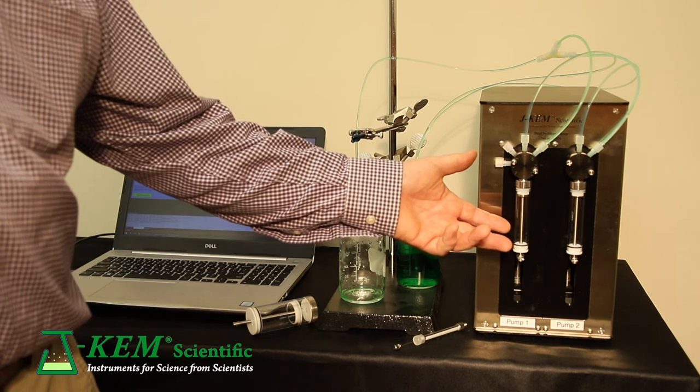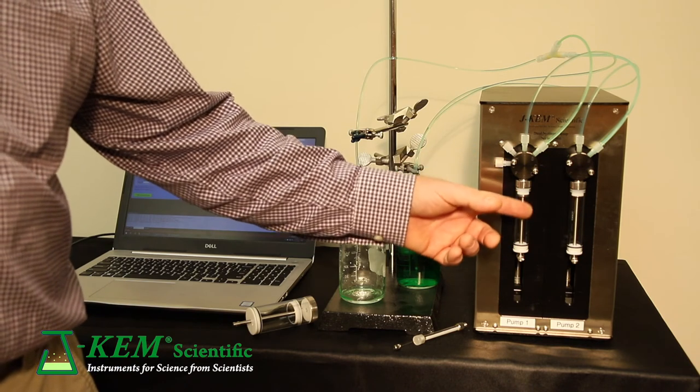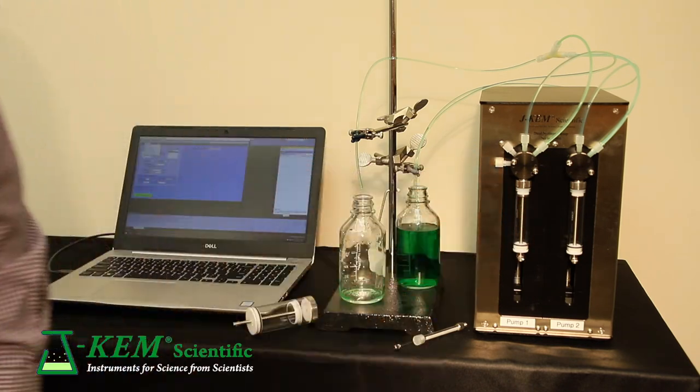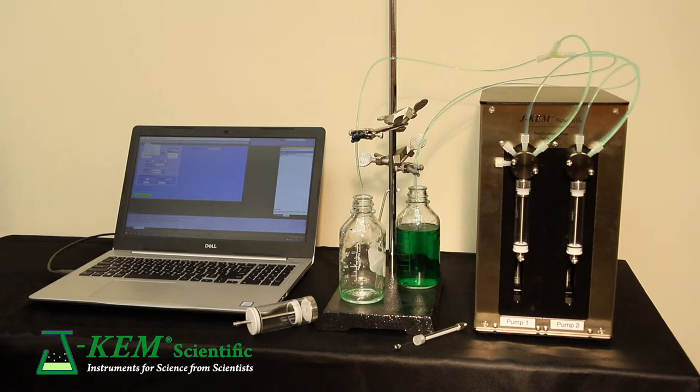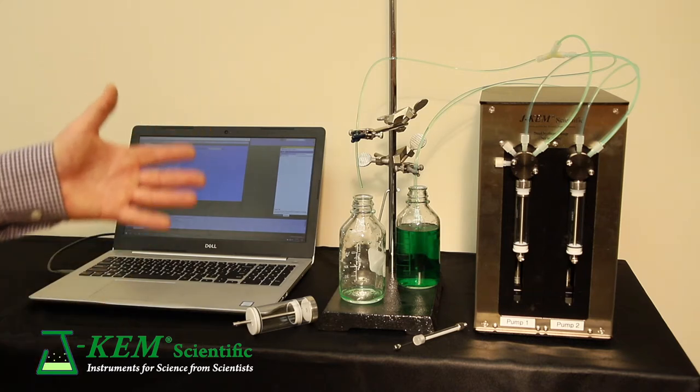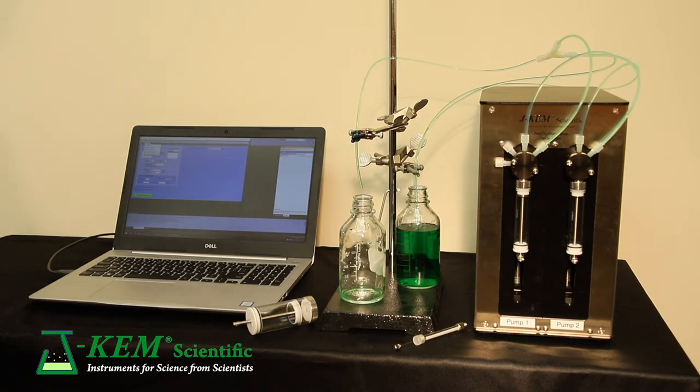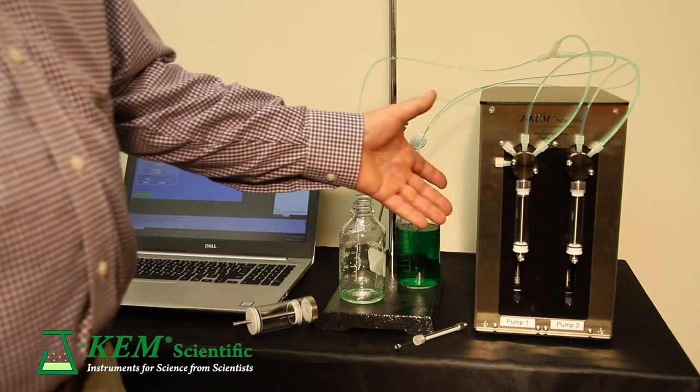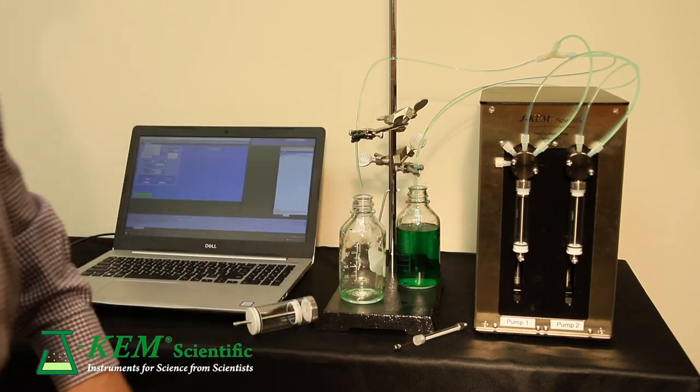Even with the 10 milliliter syringe that they have on here, the flow rate can range from 3 microliters a minute up to 150 milliliters a minute, which is a flow factor of 50,000. And you can get them available in single or dual or many sizes.